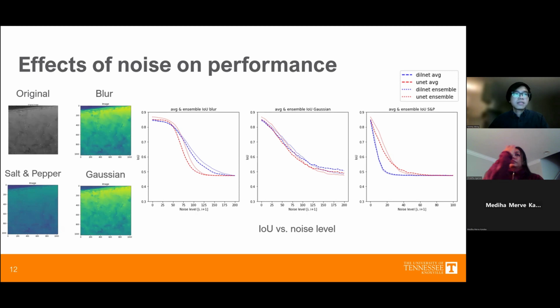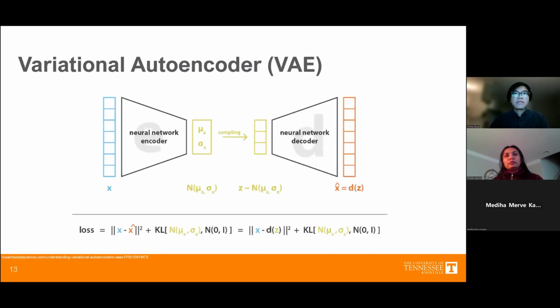Because while for small regions, when noise is applied to the image, it renders it incomprehensible for both the network and frankly for the human eye. But if more big picture information is preserved, so that the network could examine the entire image better, it lowers the drop in accuracy because of noise in the data.